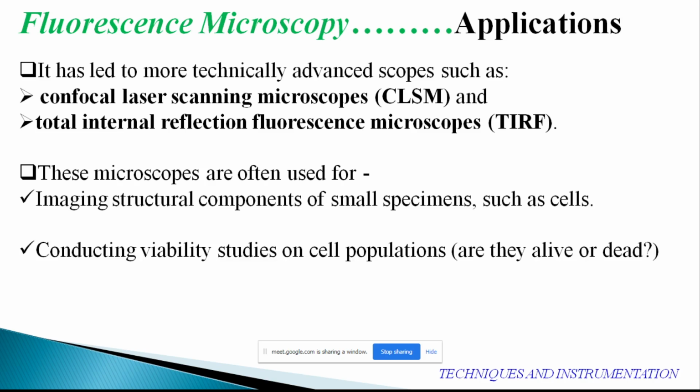In fact, imaging the genetic material within a cell, especially DNA or RNA, is also becoming possible due to this fluorescence microscopy. And another important part is that viewing a specific cell within a large population with a technique such as FISH is also possible nowadays.